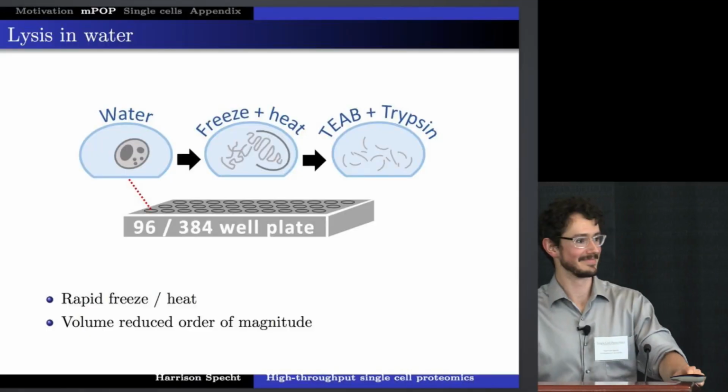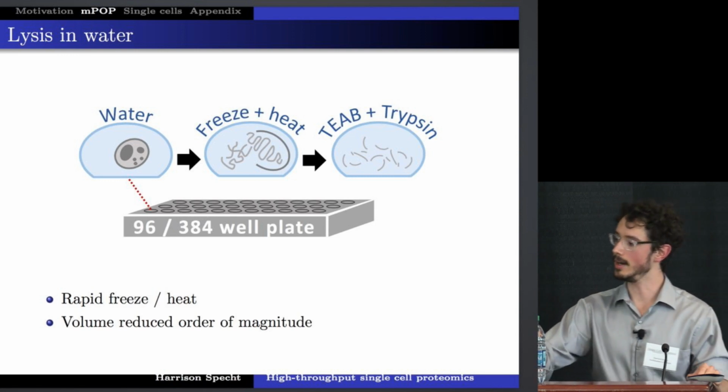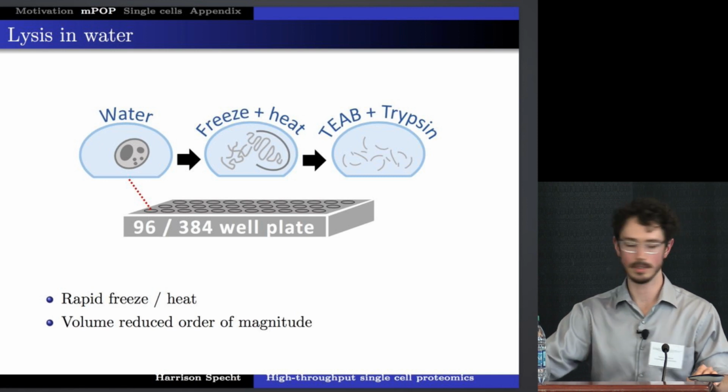So something that I will say that we've done for the single cell prep, I told you that this here is a gross simplification of what we've tried to do. We did passivate the wells using a very simple peptide mixture, such that we didn't lose single cell material to them. So we'll be describing the full methodology in the coming weeks. We're going to throw it on bioRxiv for everyone. So we're going to try and make it as detailed as possible, and hopefully it'll be quite amenable for people to try.